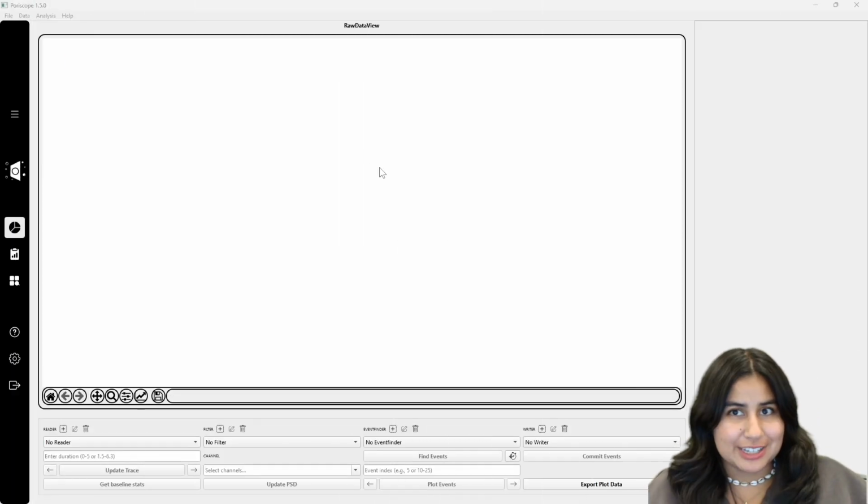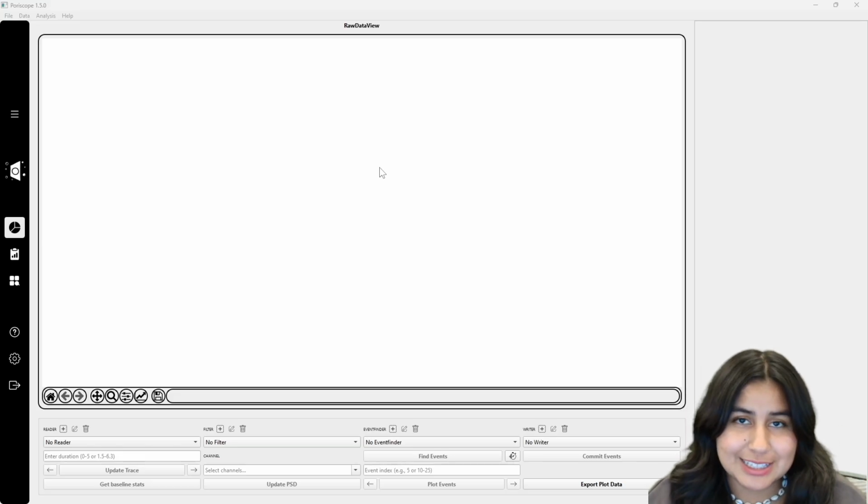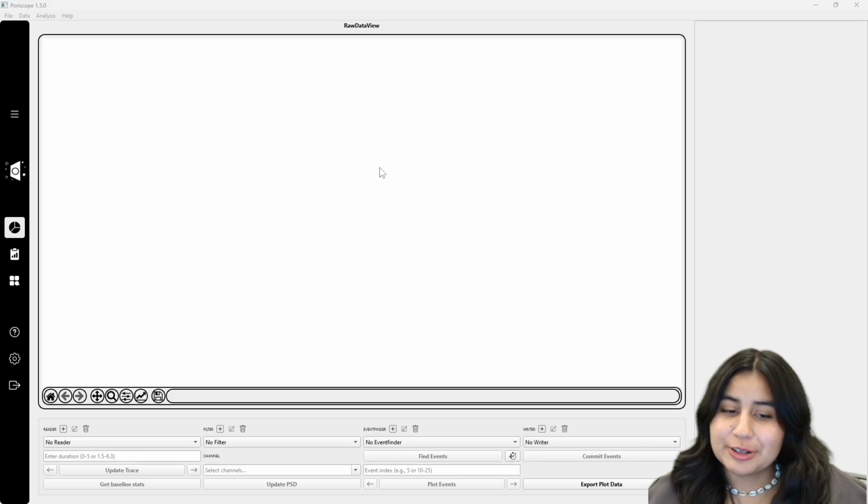To the Raw Data tab. In this video, we will walk you through how to load your data, apply filters, find events, and save these events for downstream analysis. So let's get to it.